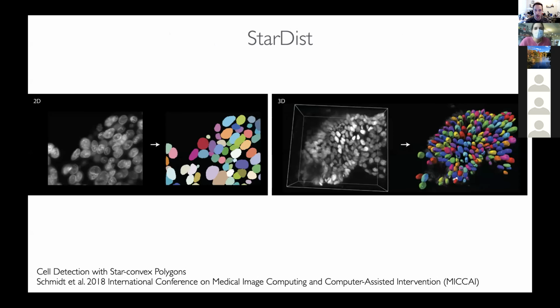Okay, so there are all examples where we're trying to improve the data for segmentation. And of course, there's other examples where we're actually segmenting. And we'll actually use StarDist today as a quick example of how you can segment nuclei and cells. This is a really easy tool to use and is much easier in terms of trying to get a good result than fiddling around with different classical filters and segmentation tools.